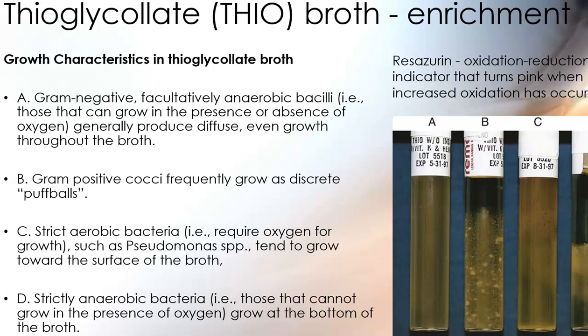Do you guys remember hearing about this stuff? Right? Nothing? A little bit? Yeah. Okay. But then there are those facultative anaerobes that are going to grow throughout the entire broth, right?